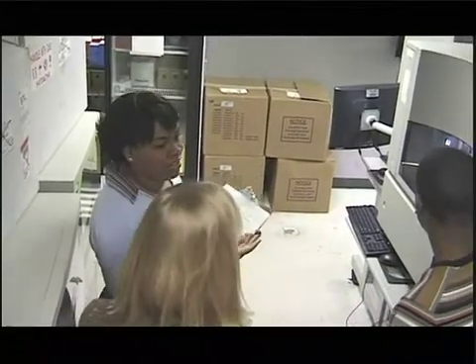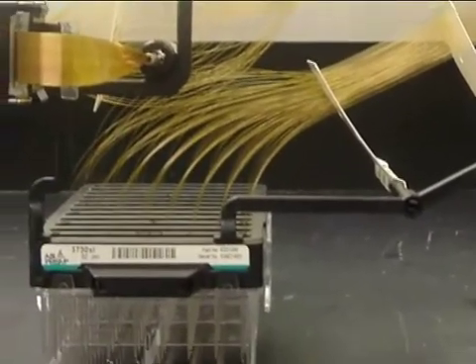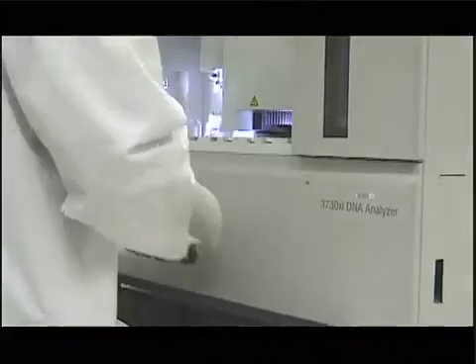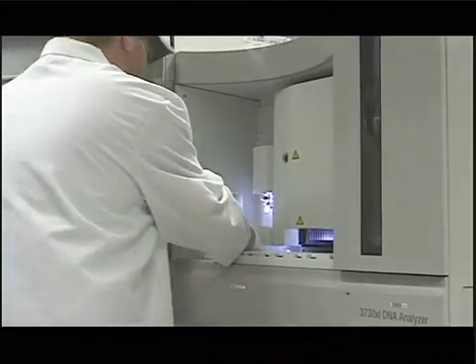This machine has a tiny capillary tube filled with a polymer that allows the DNA fragment to separate by size when an electric current is run through the polymer. So that's just like regular gel electrophoresis. Yes, but unlike conventional gel electrophoresis, this machine takes it a step further.